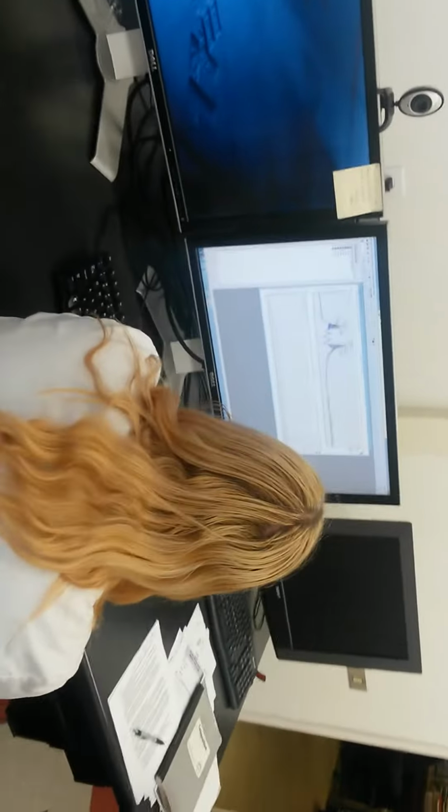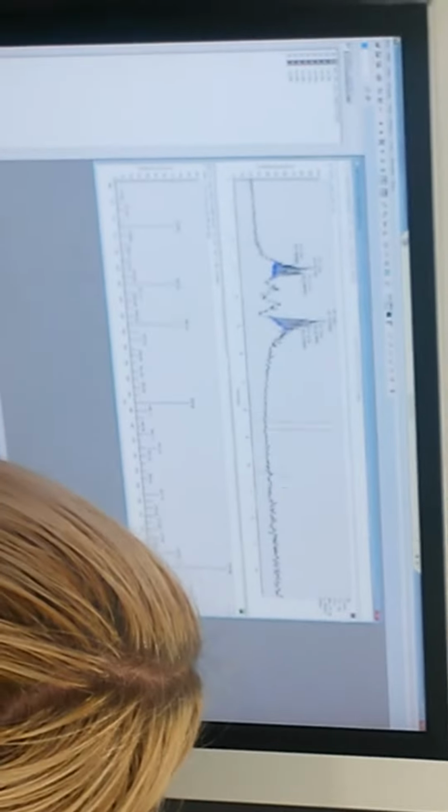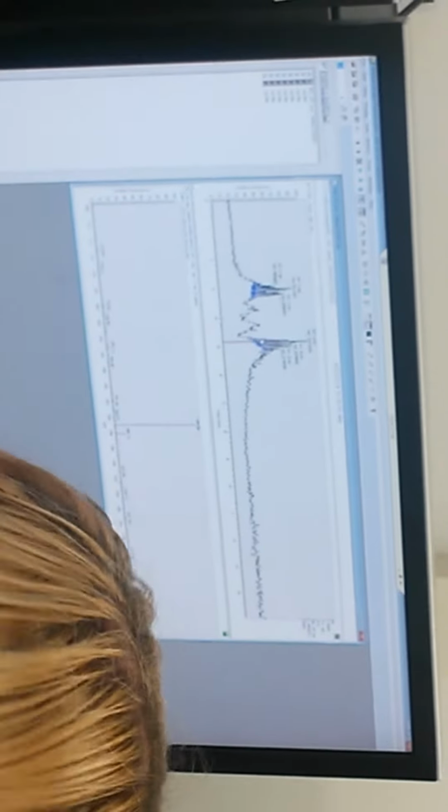Okay. Another thing, when you open up these graphs, because you go over here to open or whatever, it opens it so that you can't do anything about it. You can't move it around. You have to click this little pin right here in order to search. Push pin. It's like to kind of put it on there. Search for your sample. Okay.